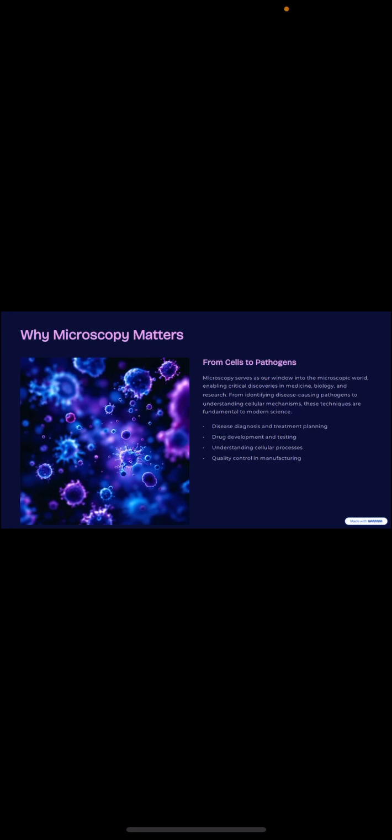Why microscopy matters? First of all, guys, microscopy and a microscope are different things. So please don't get confused over here. Microscopy is a technique of observing different objects under a microscope. It is not a microscope. Microscopy is the science of using a microscope. It is a technique of observing objects that are too small to be seen with the naked eyes. So microscopy is a technique of using a microscope.